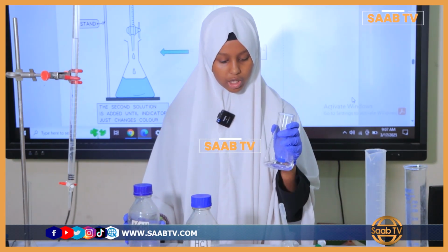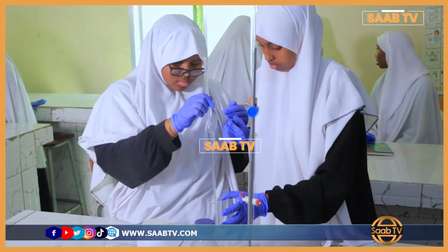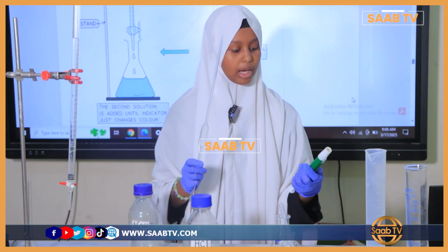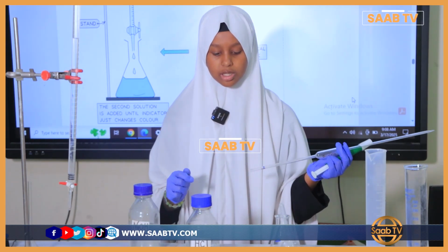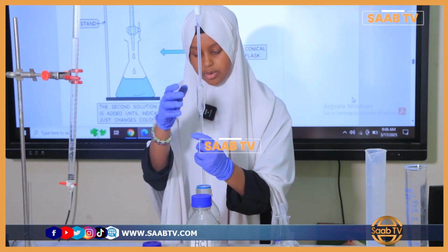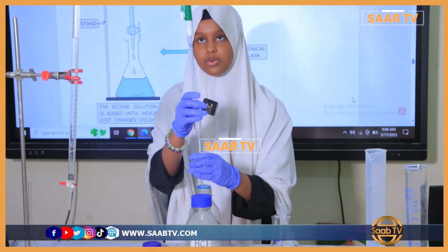So what we're going to do here is take the alkali and use the conical flask. We have a smaller conical flask. We're going to use the pipette and the pipette filler to get exactly 25 centimeters cubed of sodium hydroxide, exactly 25.